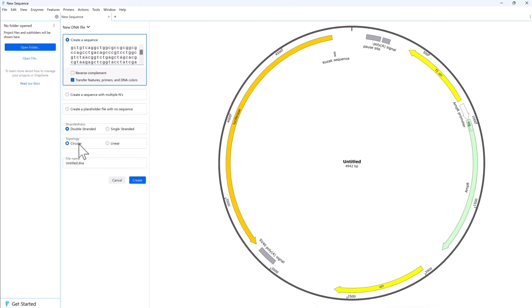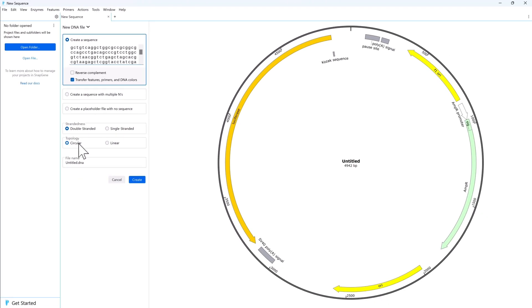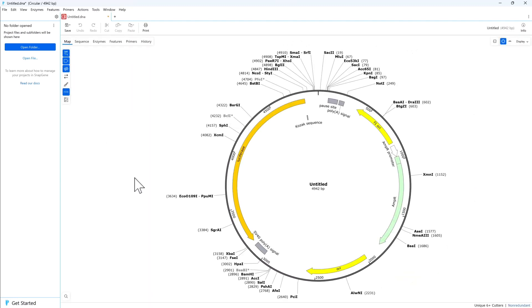SnapGene will automatically detect common features and show a preview of the file. Click Create to create and display the new file.